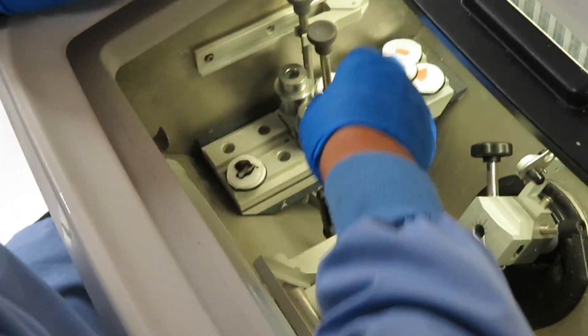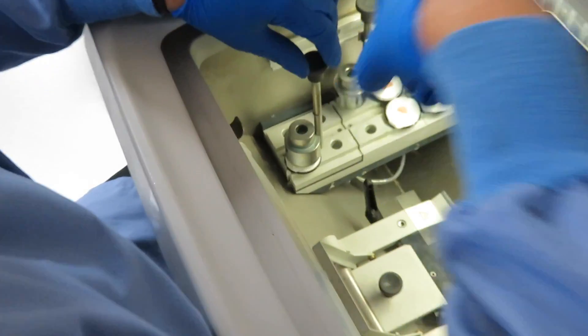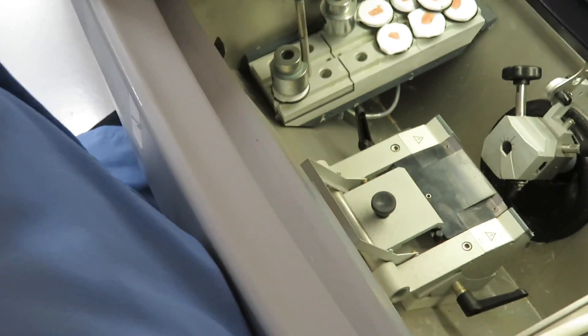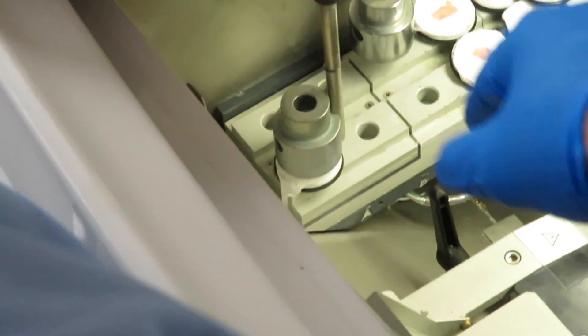Our histotech is putting OCT compound on it and we'll freeze it. The temperature of this cryostat is minus 25 degrees Celsius. He's putting freeze spray to freeze the OCT and to flatten the tissue as well.